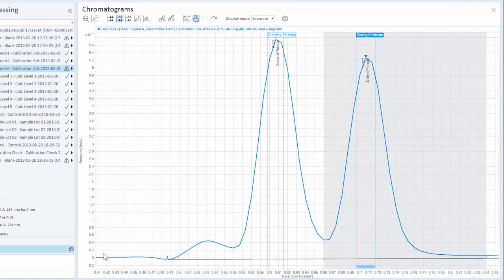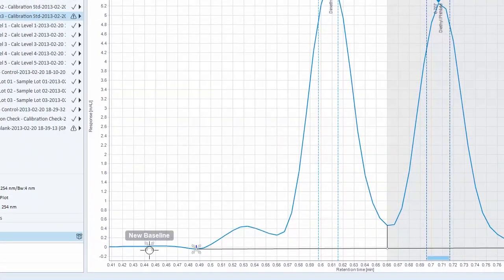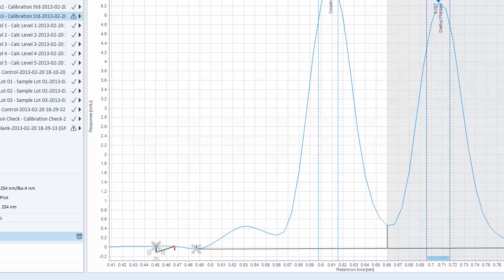To create a new baseline, hover over the trace where no baseline already exists, and click and drag.